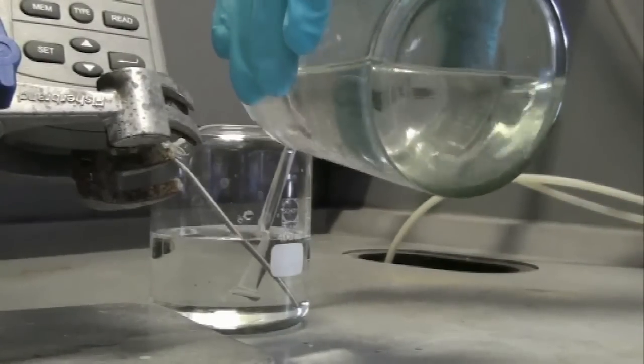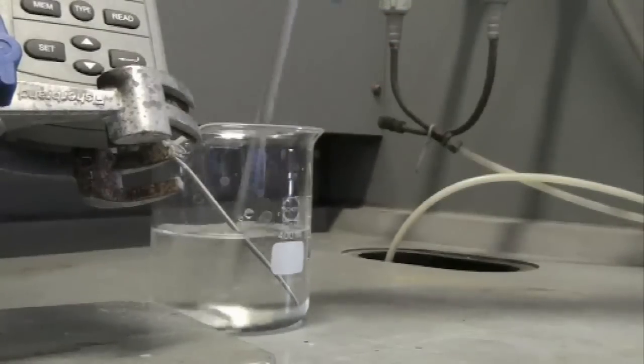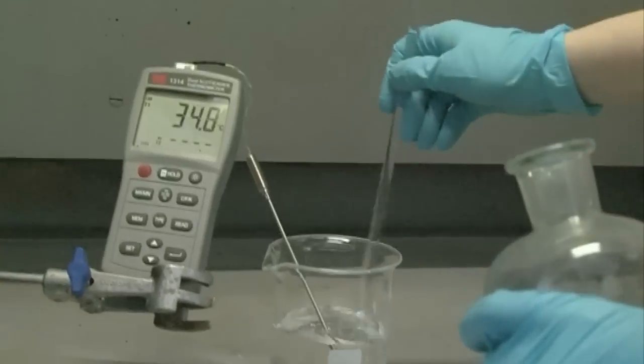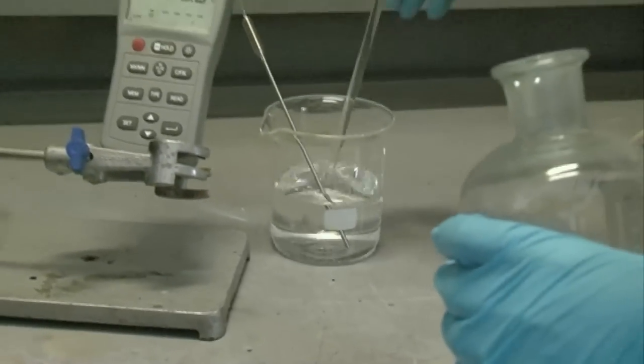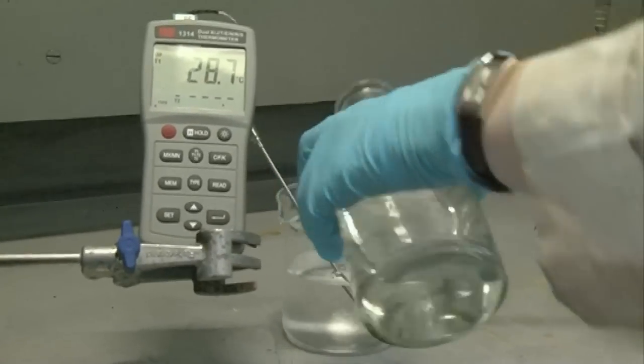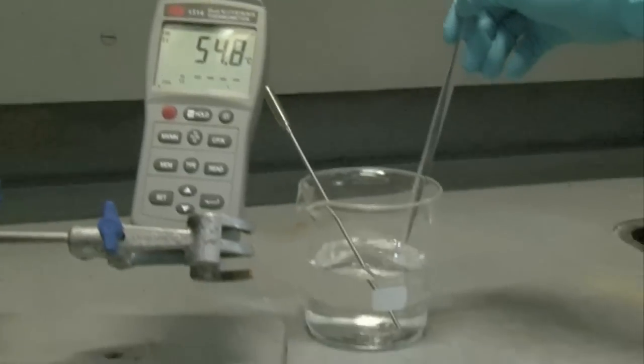Okay, so if we put a little bit in over here, give it a stir. There you go. Okay, so already we're reading. It was set at about 20 degrees when we first started. But if I do it nice and slow-ish, hopefully it won't be too much. Okay, our temperature's now gone up.